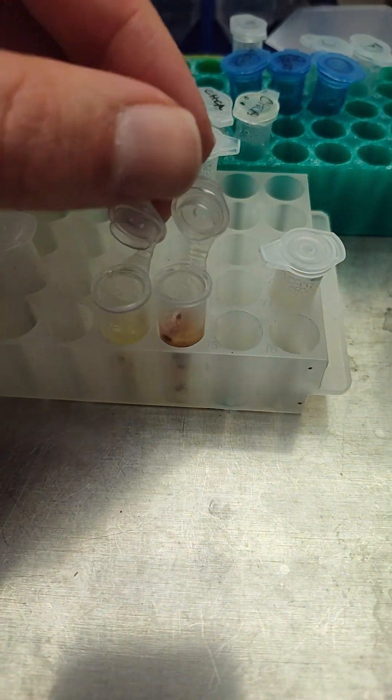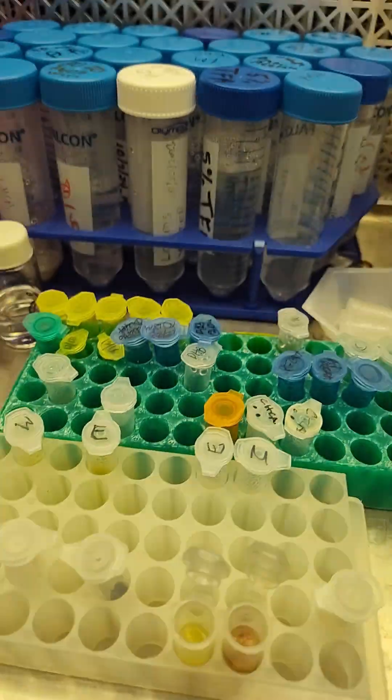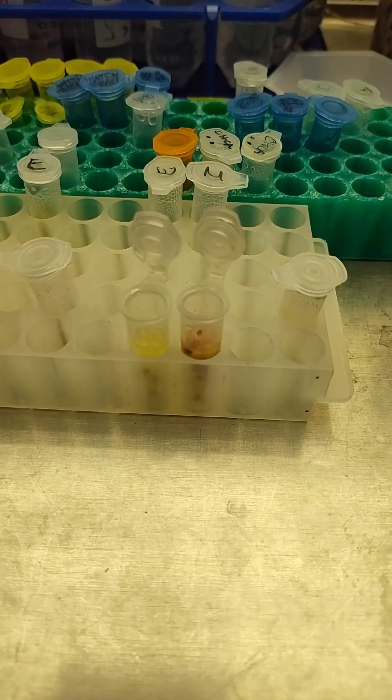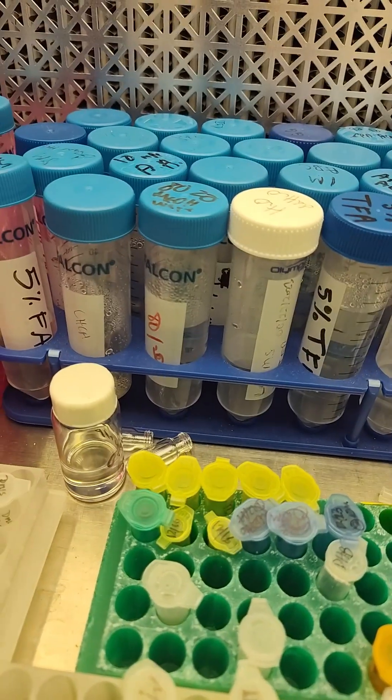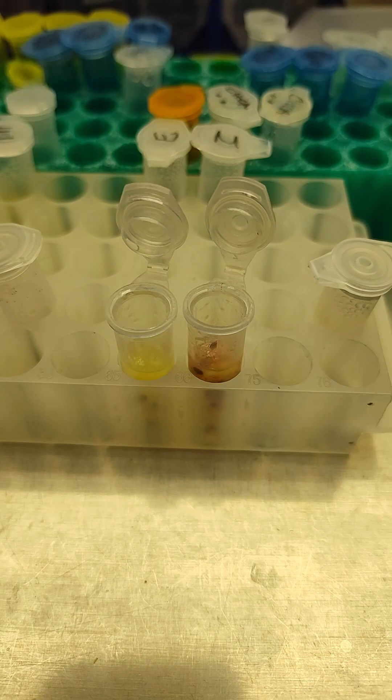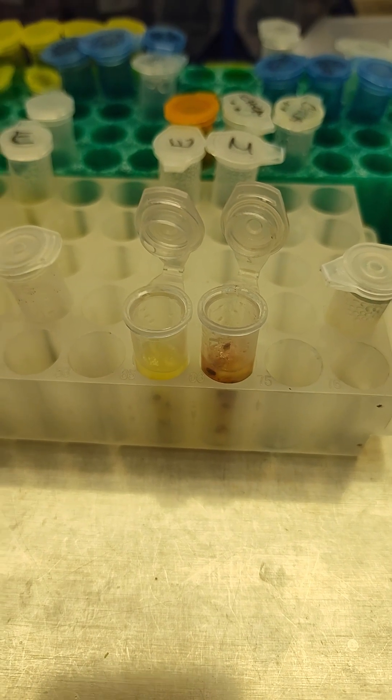The first thing we're going to do is acidify it with some of this 5% formic acid in water, and we're going to do a water extraction. Then we're going to spin that out and take some of that and dilute it into this 80-20 methanol. We're going to try to do kind of like an isolation of these red pigments and see what we can figure out.